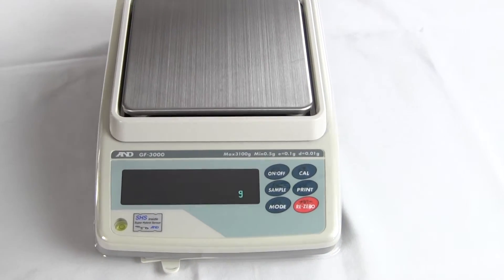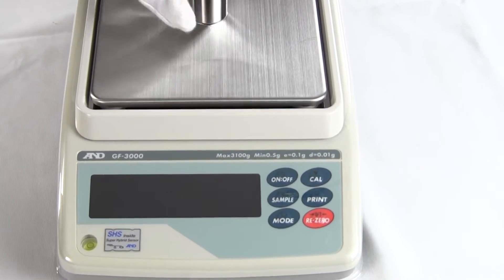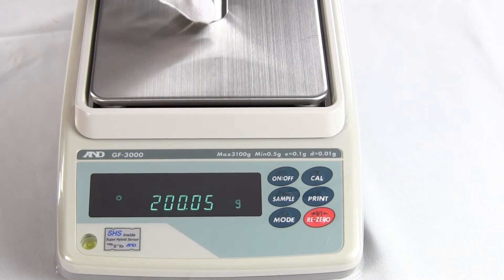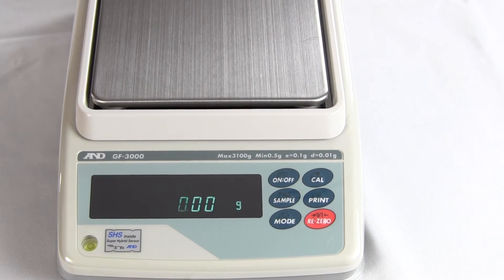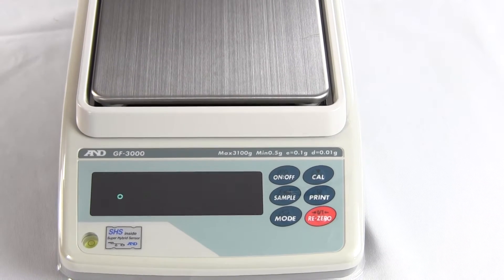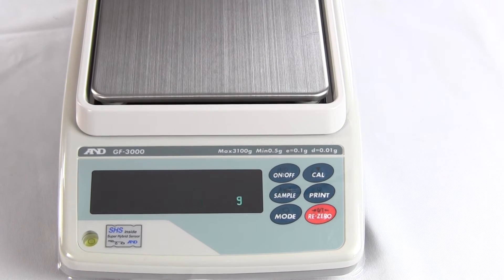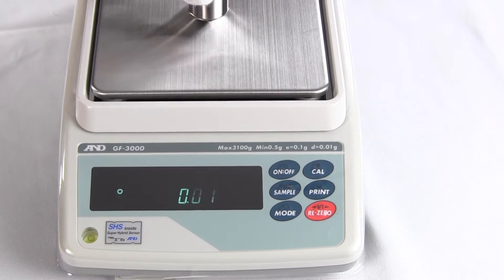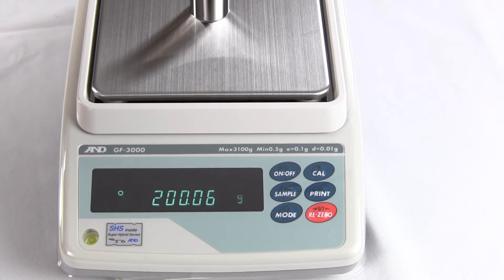This is a 200-gram ASTM Class 1 weight, and we put it on the balance. You can see the balance is off. That's because this balance has been manufactured in Japan and we're actually in Massachusetts, so the acceleration of gravity is different. We need to calibrate the balance, and we'll walk you through how to do that.